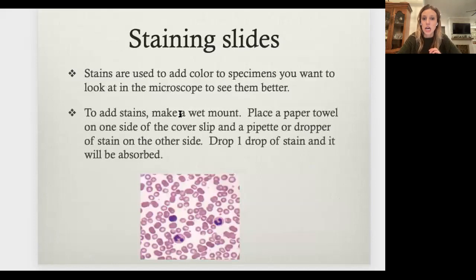So staining slides. Stains are used to add color to specimens that you want to look at in the microscope to see them better. So write staining slides, stain. Then just write add color to specimens.